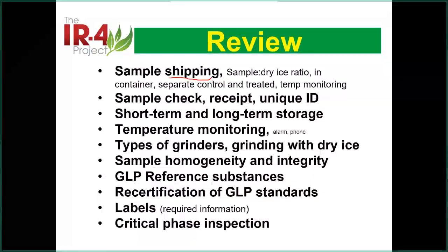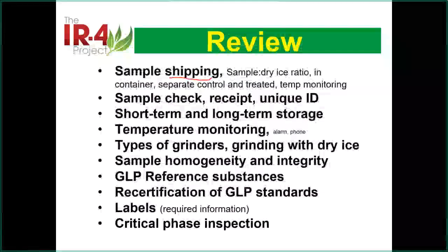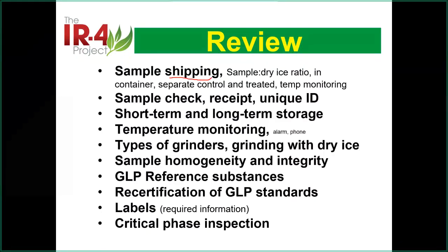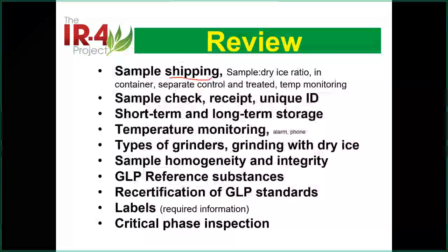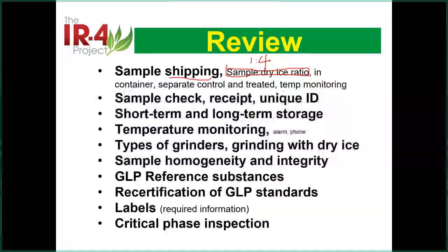So the container should be relatively durable. It's not just a very thin paper, so at least a very strong cardboard box. I prefer the plastic, and also you need to do the temperature monitoring. So that's a big issue, because if we keep talking about temperature monitoring, it will take a little bit more work.